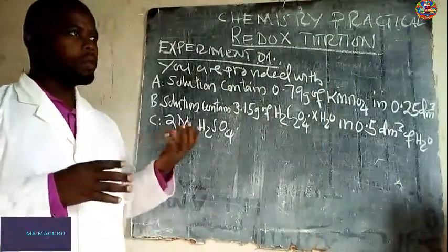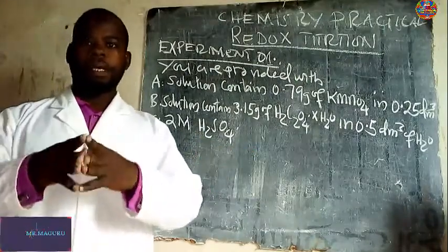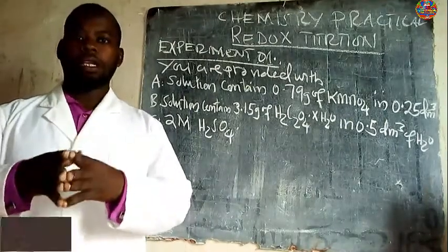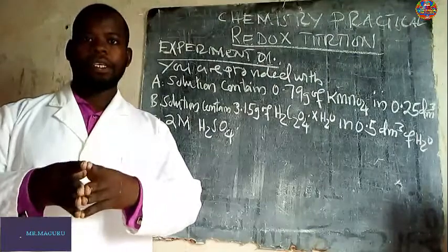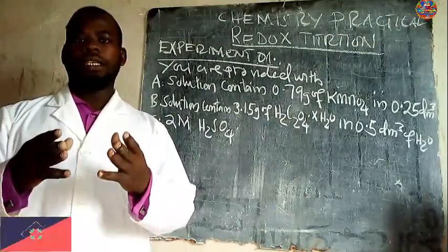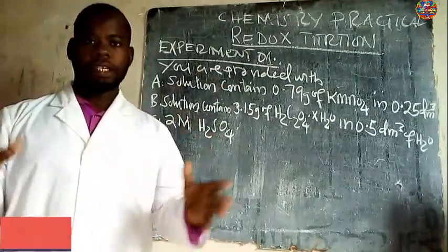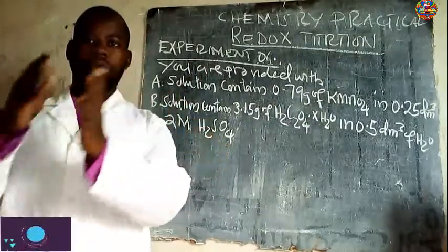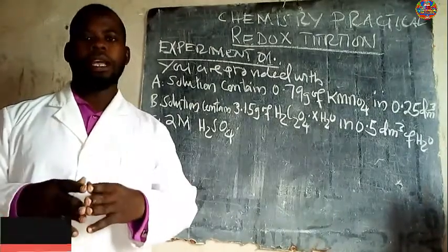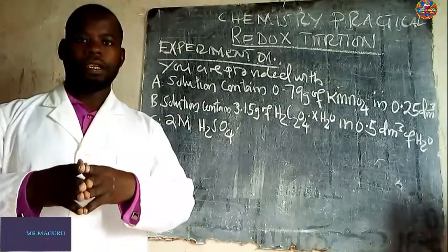So today I'm going to tell you how to solve these questions, and I will show you practically the end point, the color change from one step to another. So you're welcome to the first experiment. If you are not ready for the first lesson about the chemical reactions, the half reduction reaction, oxidation, half reaction, let's communicate. I will give you that tutorial video for that lesson.